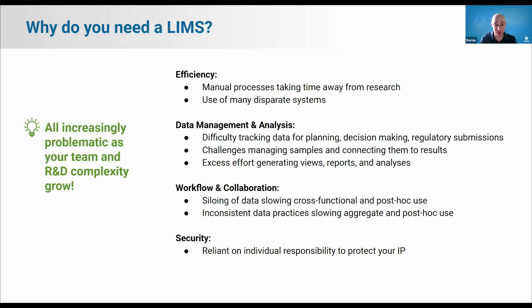You'll find a lot of workflow and collaboration problems when you explore your own organizations. Often the siloing of data slows cross-functional and post-hoc use. You can think of bioinformatics applications, as well as inconsistent data practices between individuals, between teams, causing some of the same kinds of problems.